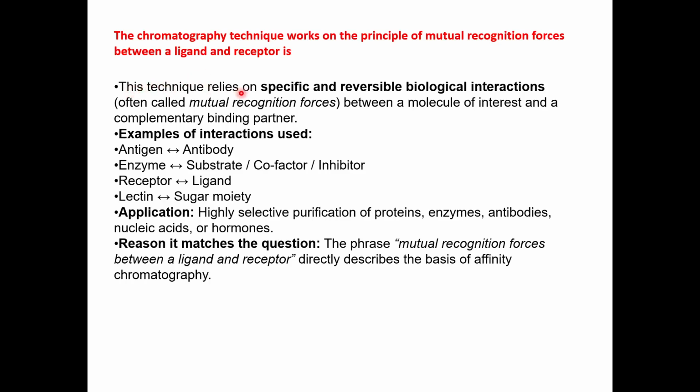This technique relies on specific and reversible biological interactions, which is often called mutual recognition forces. So, this is an interaction between a molecule of interest and a complementary binding partner. These binding partners can be anything as long as it is specific.